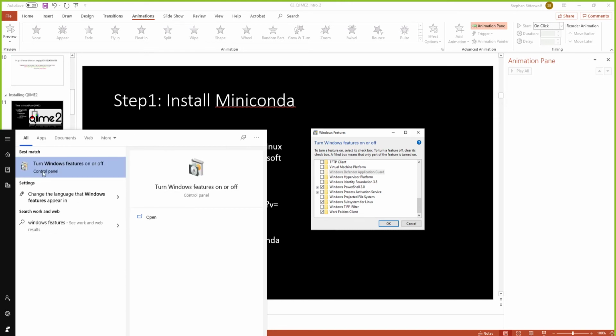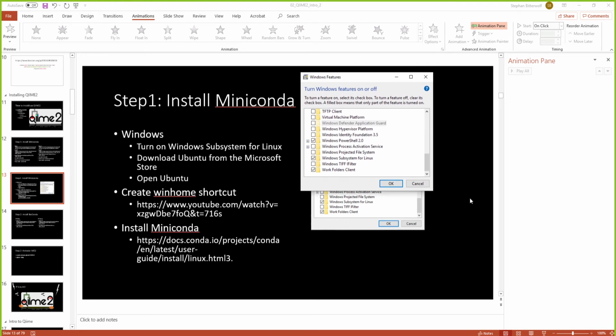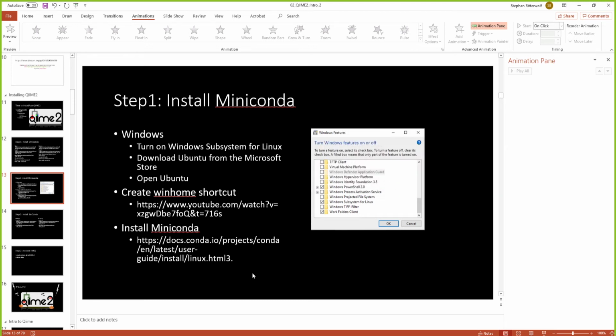Windows features. So I have that checked off already, but I can't seem to find it anywhere. And I've already restarted my computer multiple times. That's good. So you just check that off. Make sure that this is checked. Mike, is it checked for you? If not, it's really simple. You just press the button. I was muted. I just checked it. Okay. Then you should press OK.